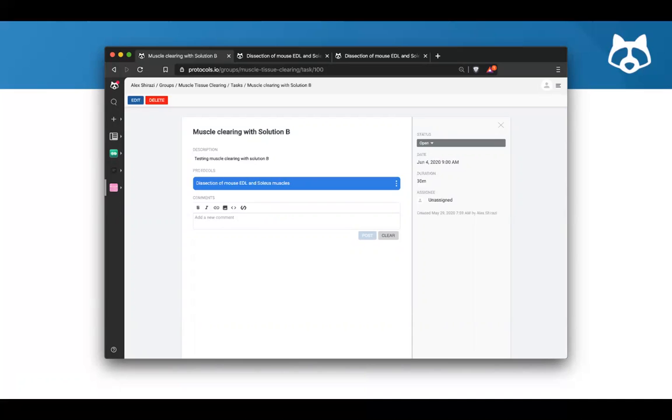Different task managers or product management tools might have the opportunity to give you priority levels. You really have a lot of flexibility here because you can add custom titles if it's, for example, an urgent task, or let's say you want to assign colors to a particular person in addition to assigning them, or maybe you're using colors as a way to assign priority.